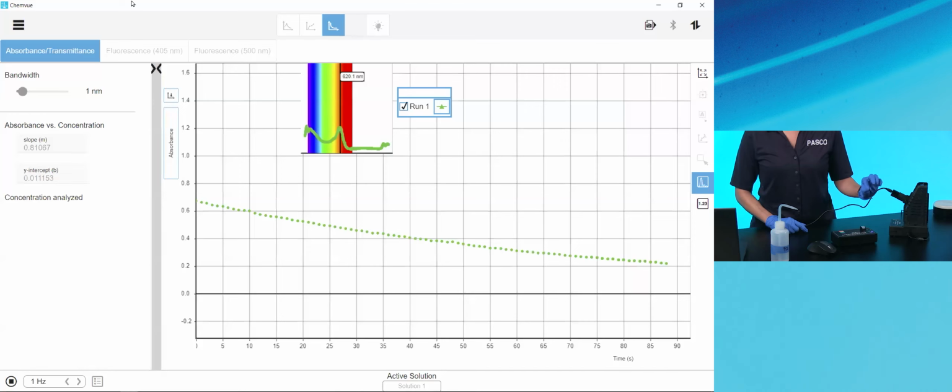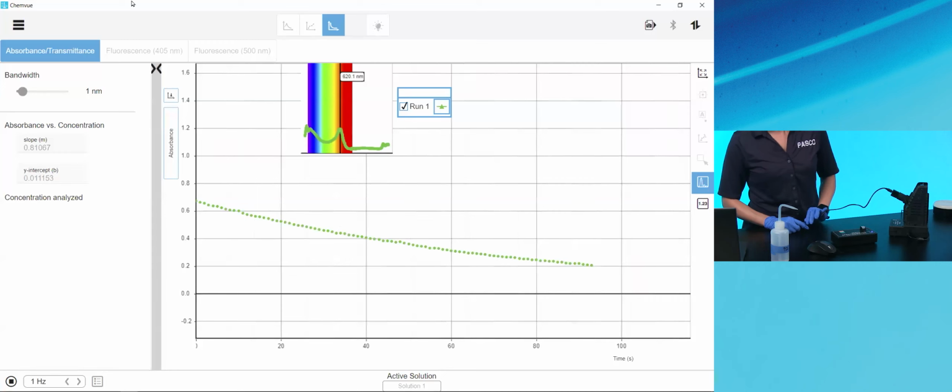It keeps those points coordinated throughout the run where it matters the most. That's what I'm going to show after this kinetics reaction is all done. The camera is a separate accessory. The melting point apparatus comes with some capillary tubes and an eyepiece.